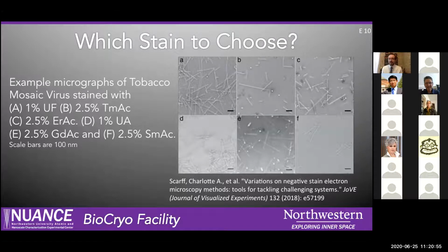They produce widely varying contrasts and widely varying resolutions, and some may or may not be disruptive to your sample itself. So you want to take that into consideration as well. There are other variables in there, pH and so forth.